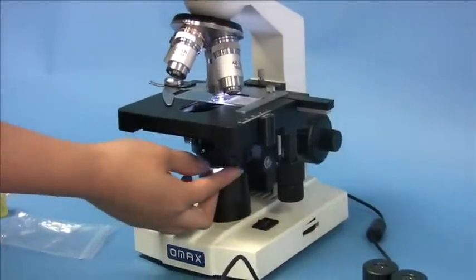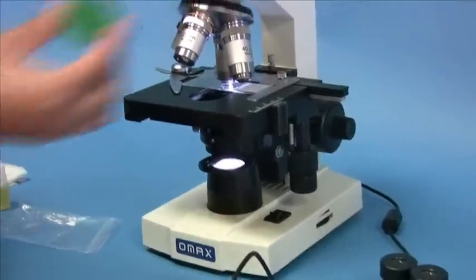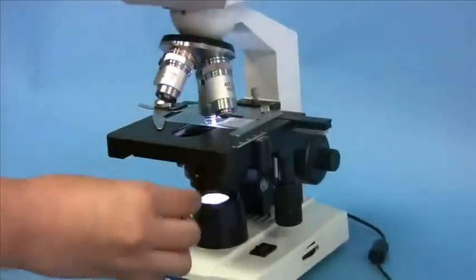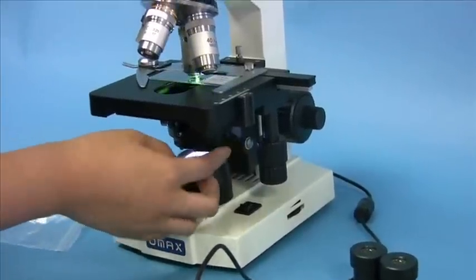You can also change the color using a color filter and simply place it in the filter holder and slide it under the condenser.